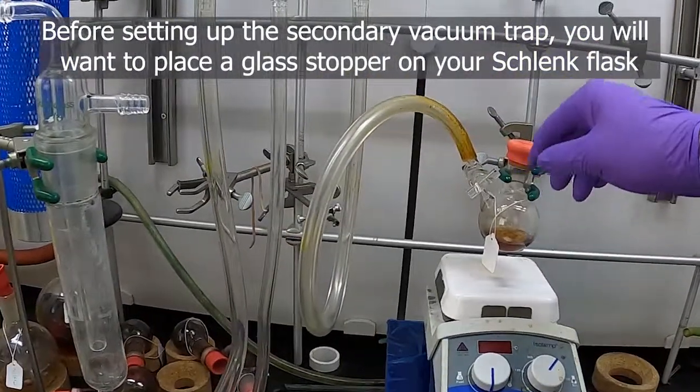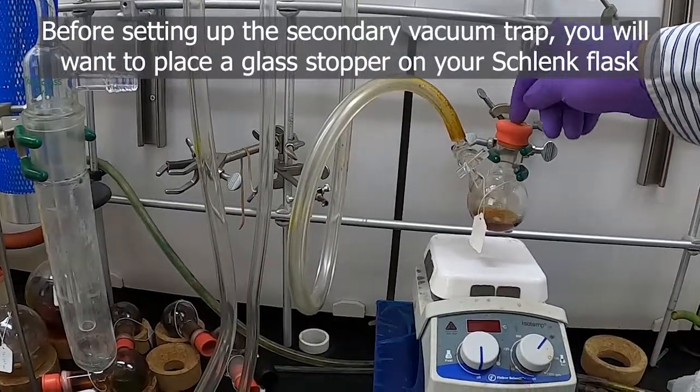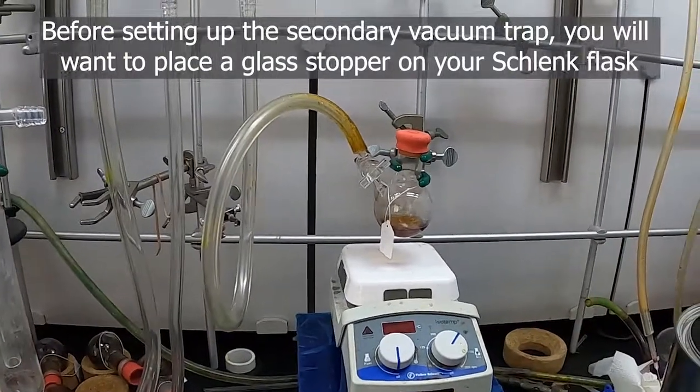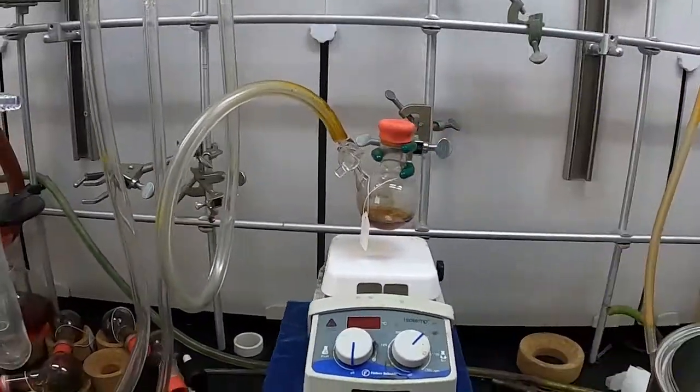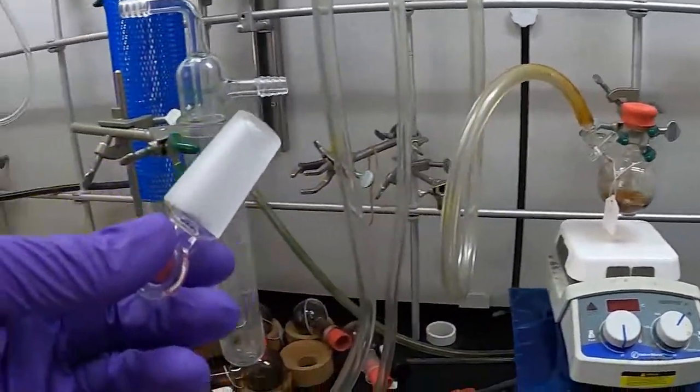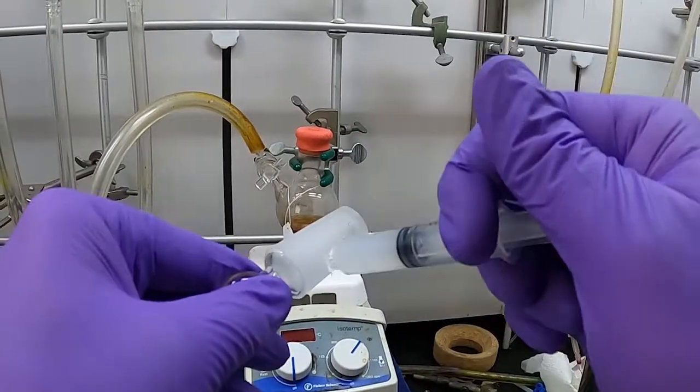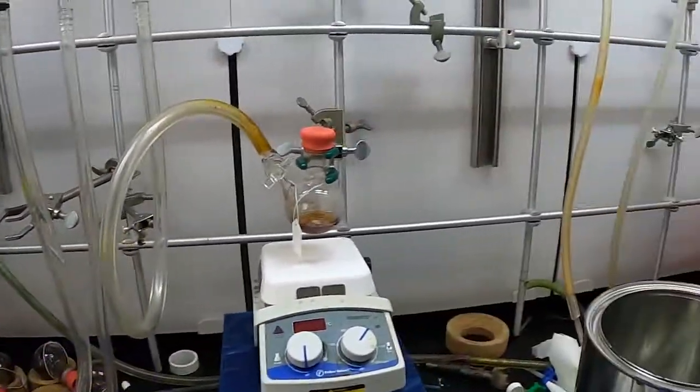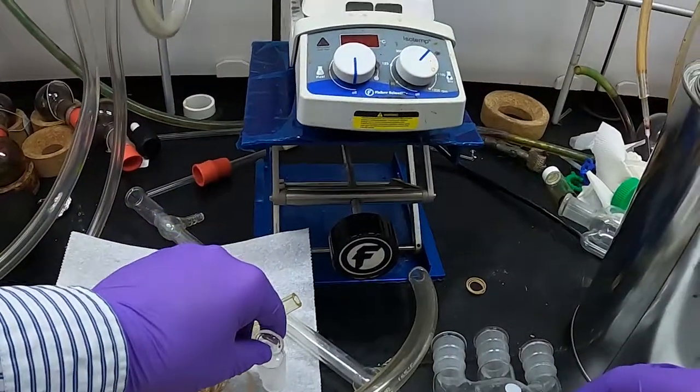The first thing we want to do is take off this septum. As you can see, it's cracked and there's holes punctured in it already. We don't want air to be pulled in by pulling vacuum directly under that, so we're going to replace this with a glass stopper. First, we grab a glass stopper and put some grease on it. Now it's all set to be put in our flask.